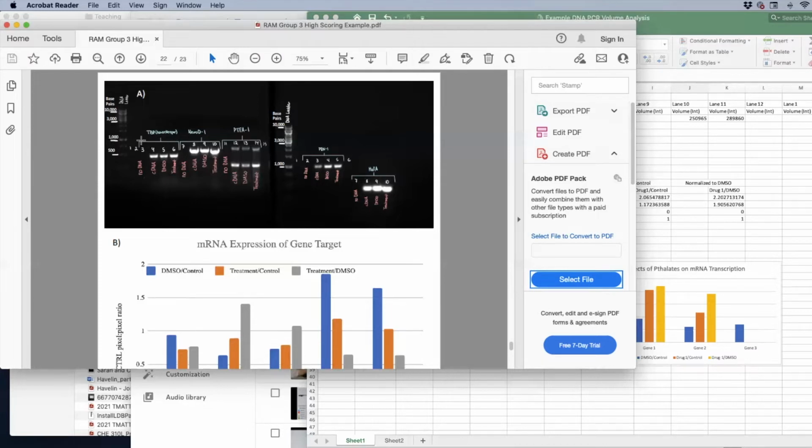So this is gene 1, no cDNA. And then there are 3 other treatments. They're calling this no DNA. So no cDNA control, right? That shouldn't have any signal. And theirs don't. And then this one's just your control treatment. And then DMSO. So these guys use phthalates, and then your drug. So you want to annotate it just like this, so I know what band is what.